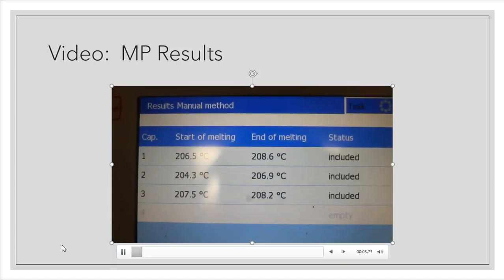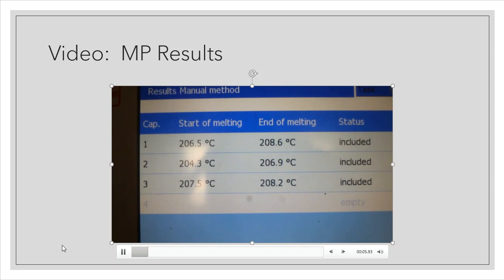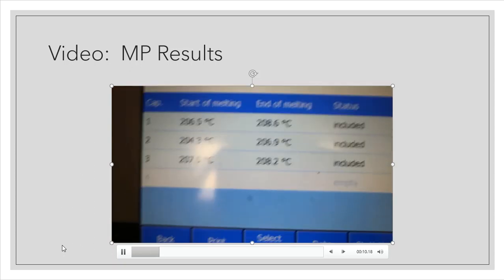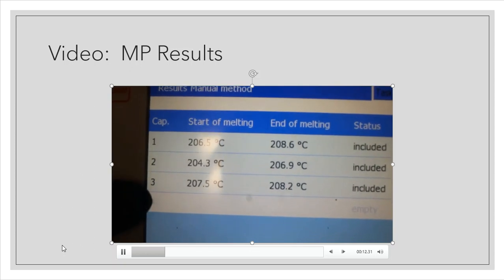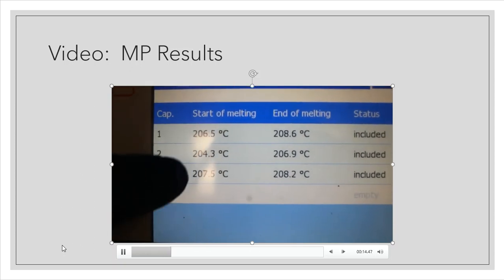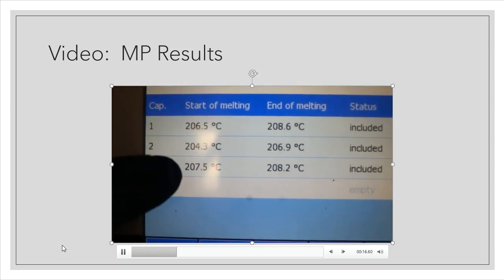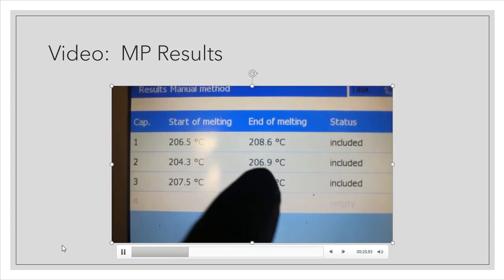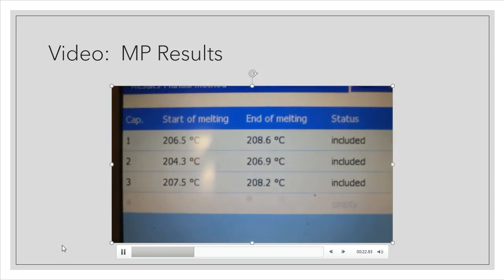So I'm going to brag a little bit on these melting points. Look, all three of them did not give me a problem this time. I can't believe it. Well, in spot number one, spot number two, and spot number three, look at the start melting temperatures, 206, 204, 207. And then the end of melting, look at these, 208, 206, and 208.